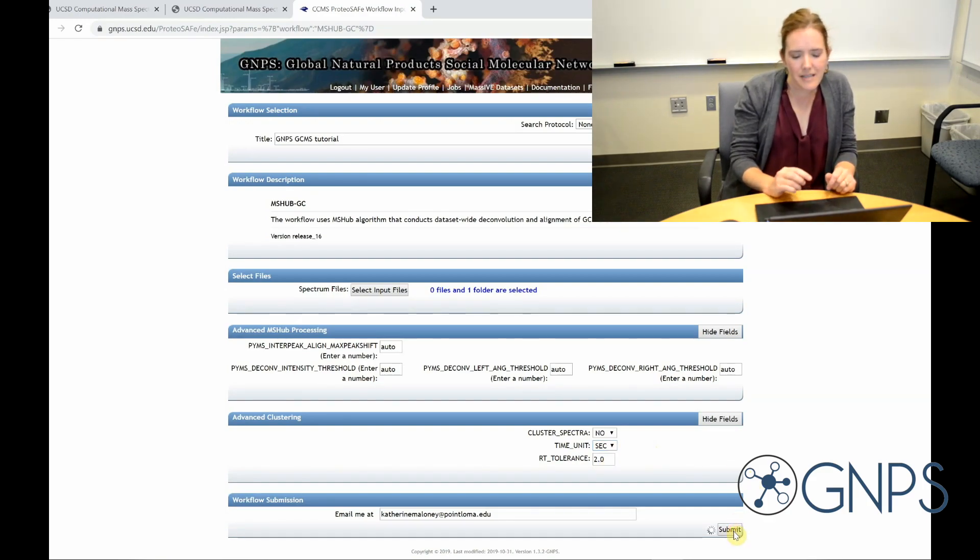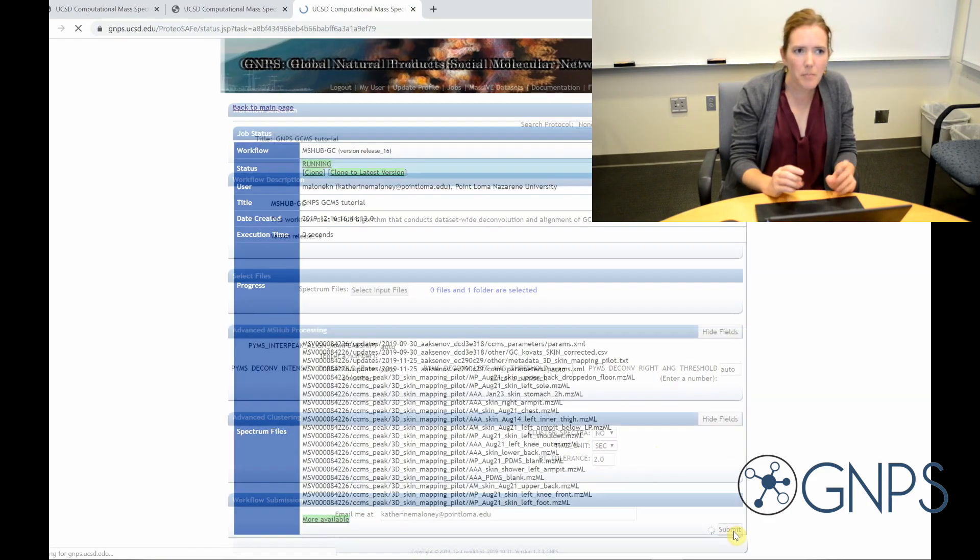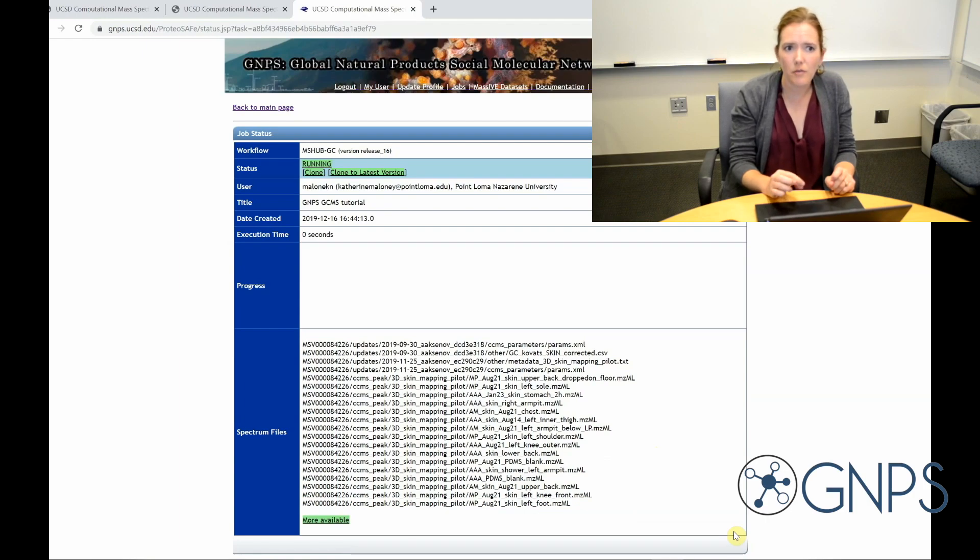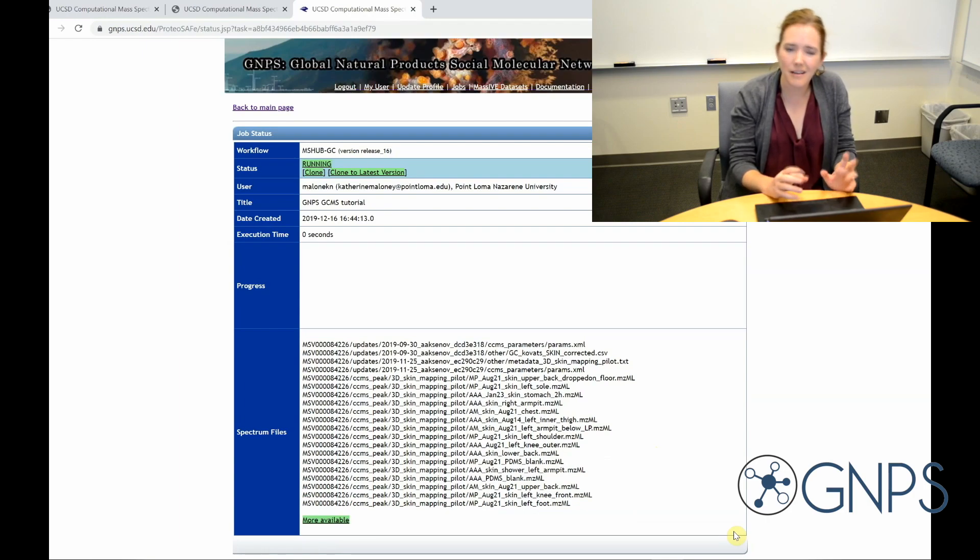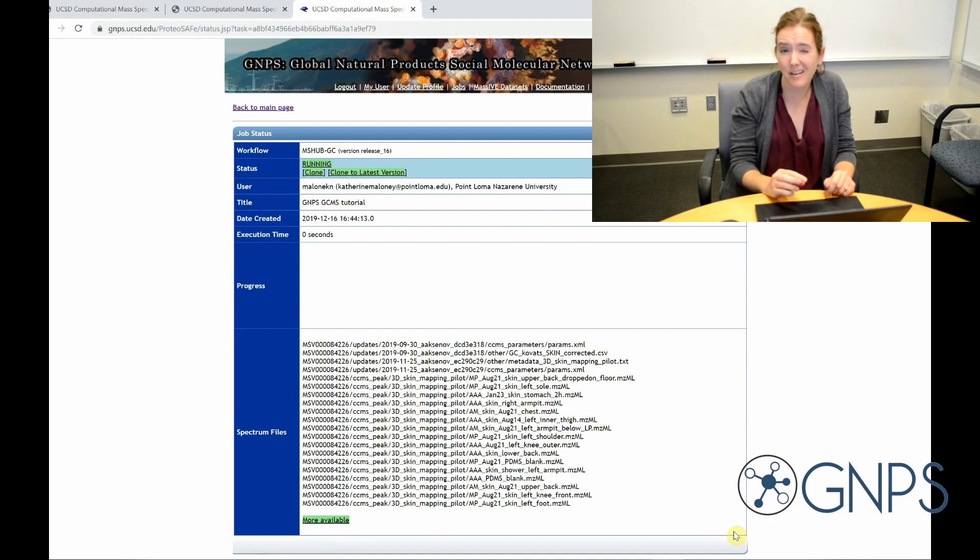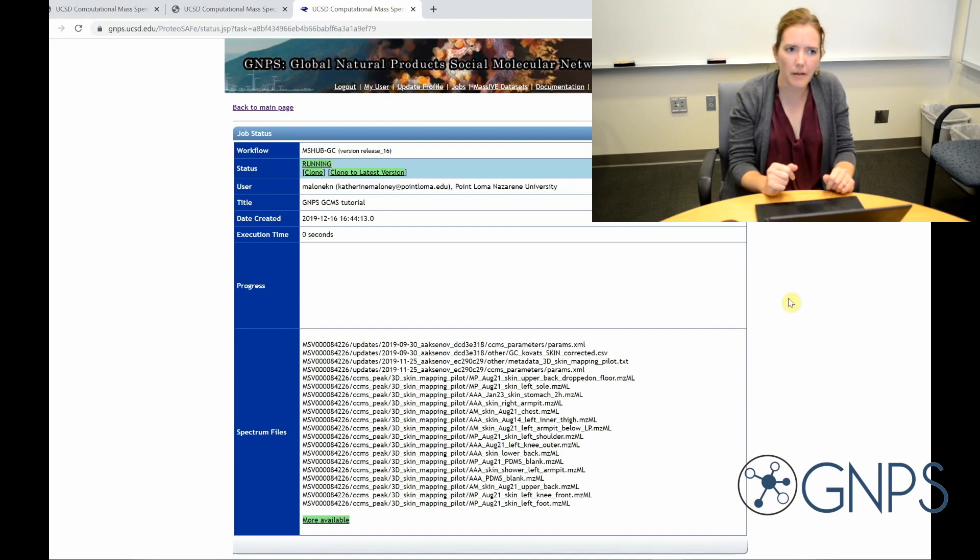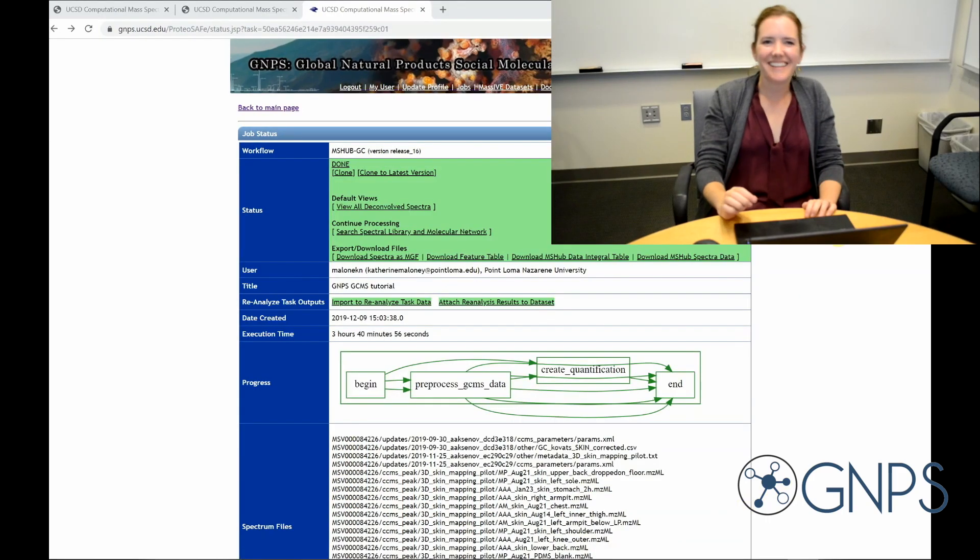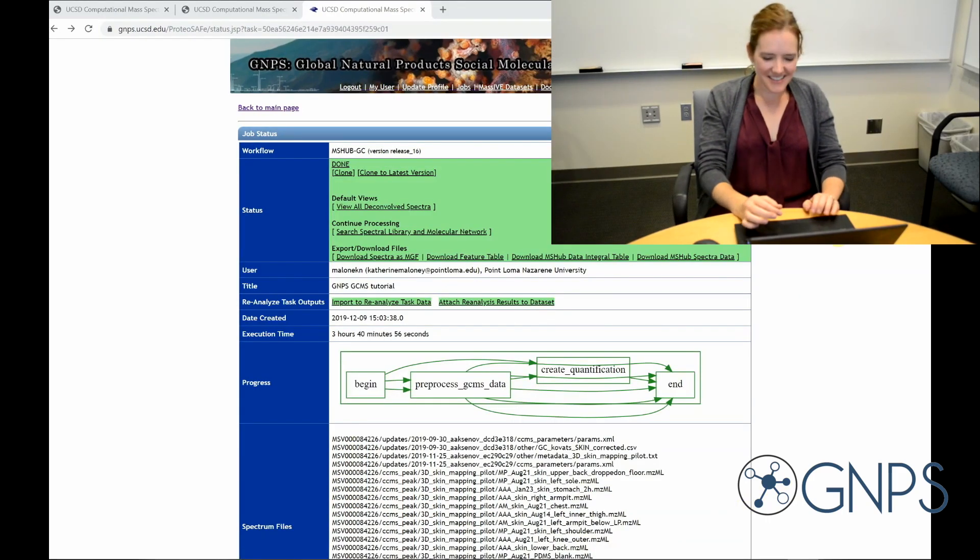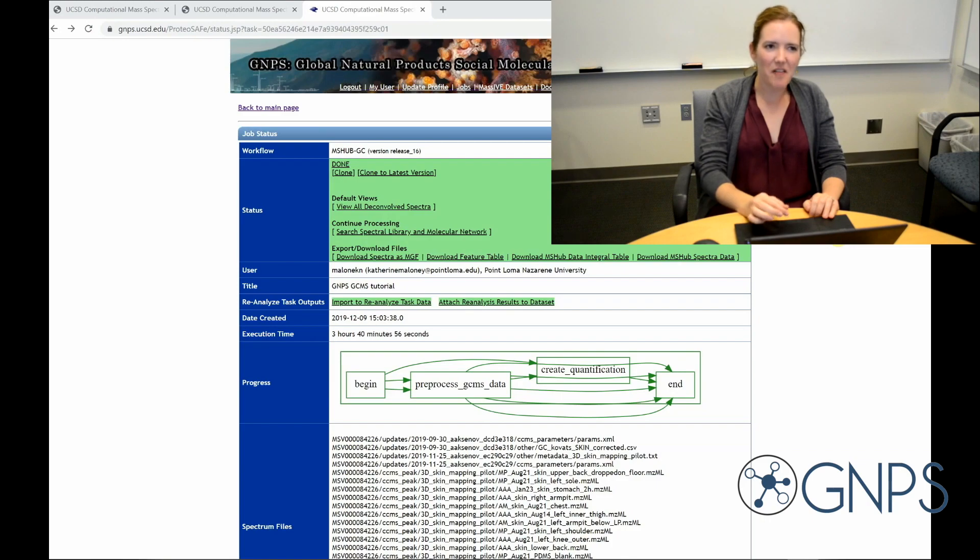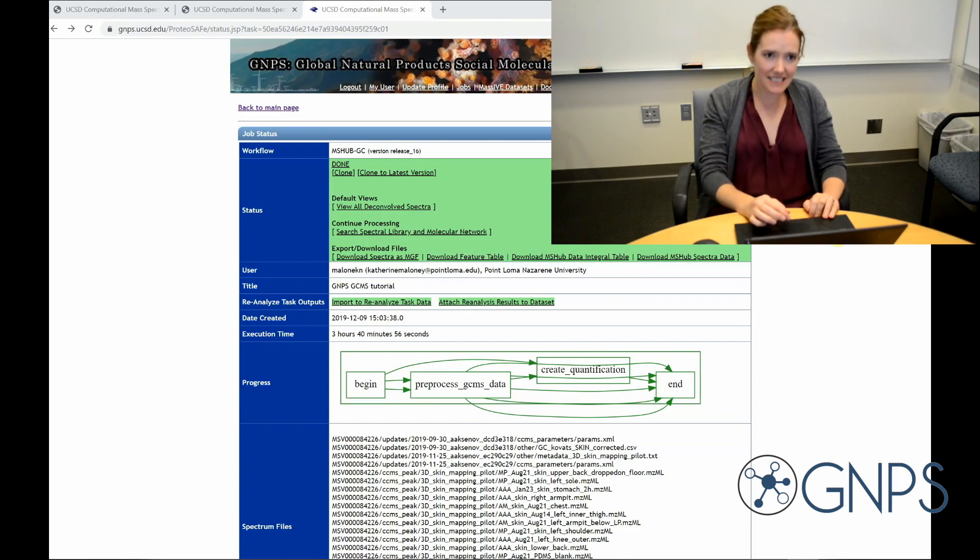So it takes about a minute per file to do this part if you use the files in CDF format and a little bit longer for mzml files. The time is also going to vary depending on how many other users are running jobs at the time. So this may be a while. Okay, so the deconvolution is complete.